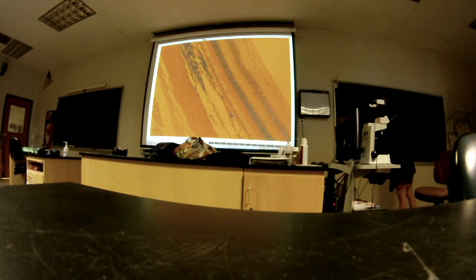This is the choroid. Okay, then you have rods and cones here, and then you have bipolar neurons or cells, and then ganglion.